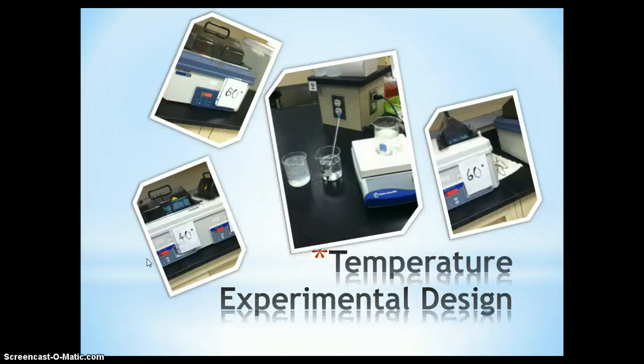So preparing for our experiment. We prepared 6 test tubes because we wanted to test them at 6 different temperatures. As you can see here, this beaker filled with ice water was our 10°C environment. This was our 20°C environment, and the beaker on the hot plate was our 100°C environment.